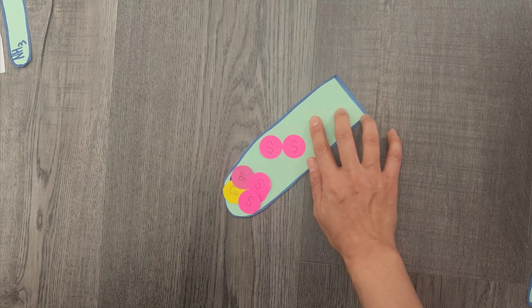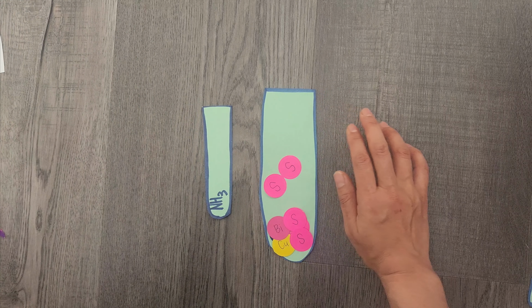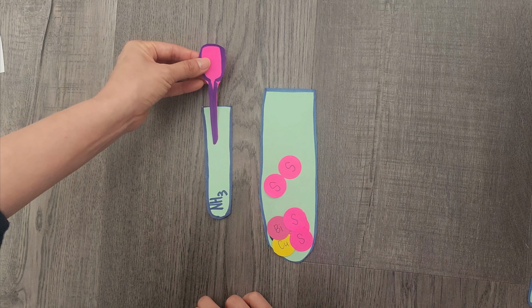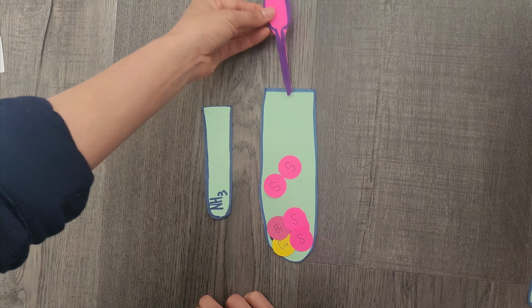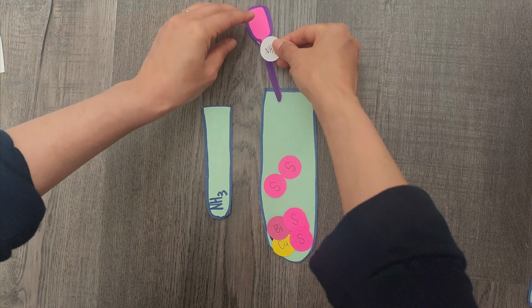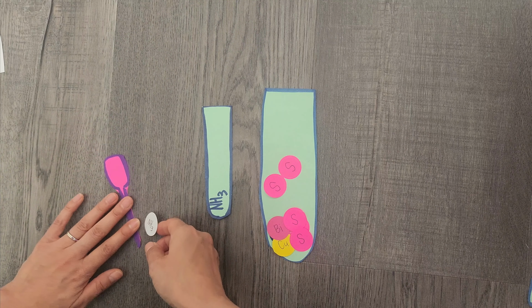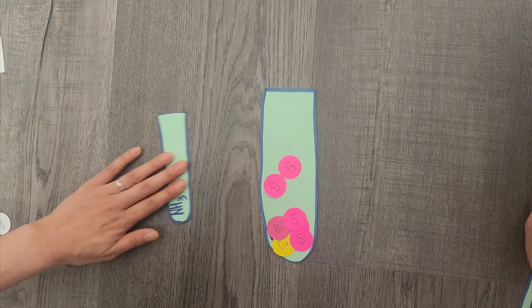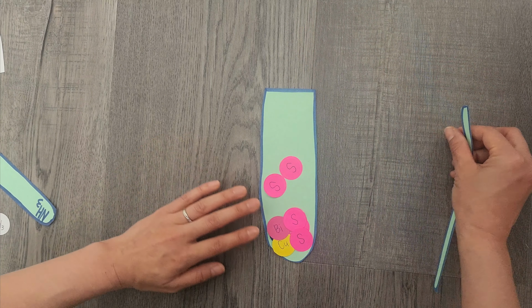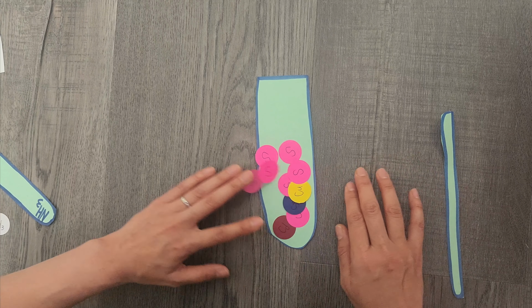Then again, you're going to add 1 drop of the NH3, the one you diluted. You're going to take this and place 1 drop. Here, I forgot to add this in. It's my 1 drop. And then allow it to mix. You're going to mix them all up. So the pellet is going to get disturbed, and that's okay because we're going to centrifuge it again.